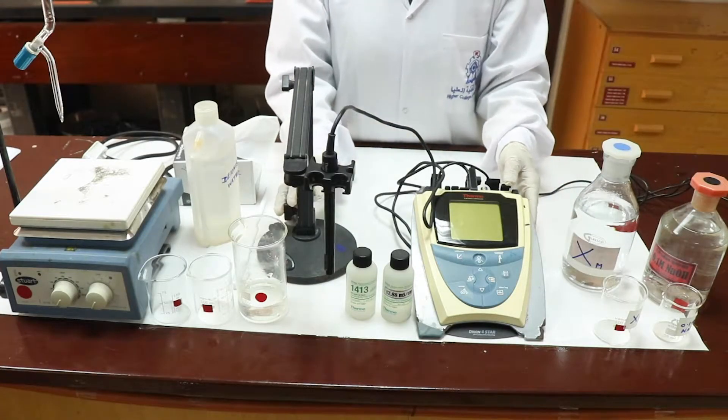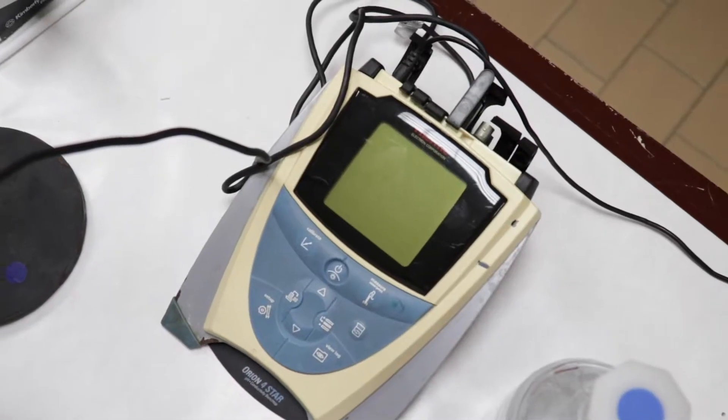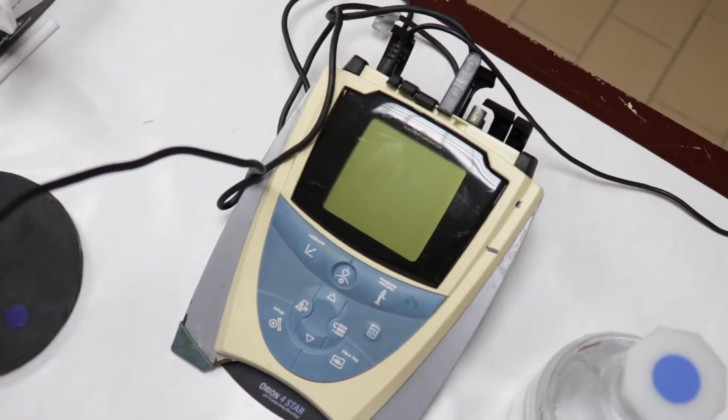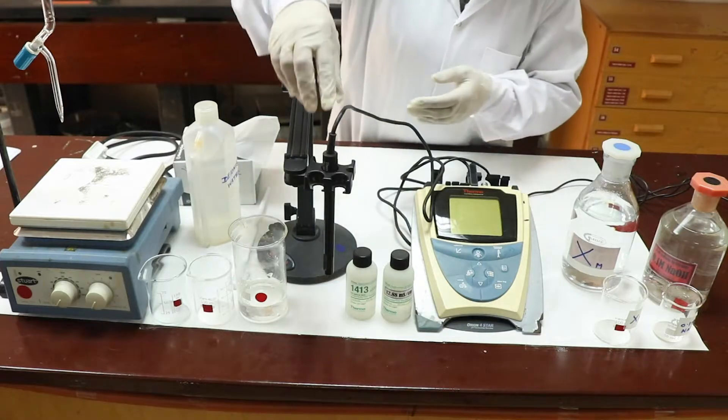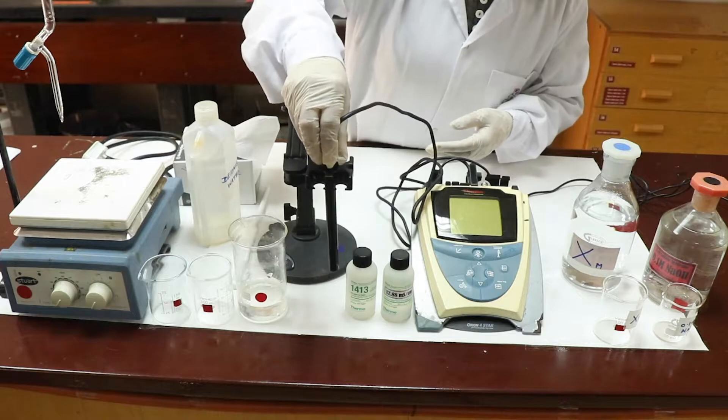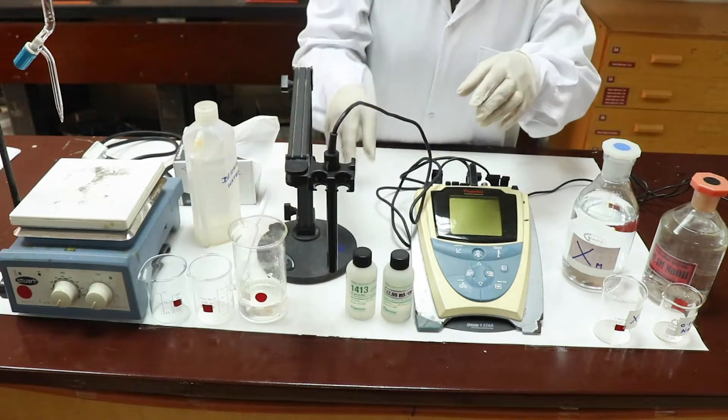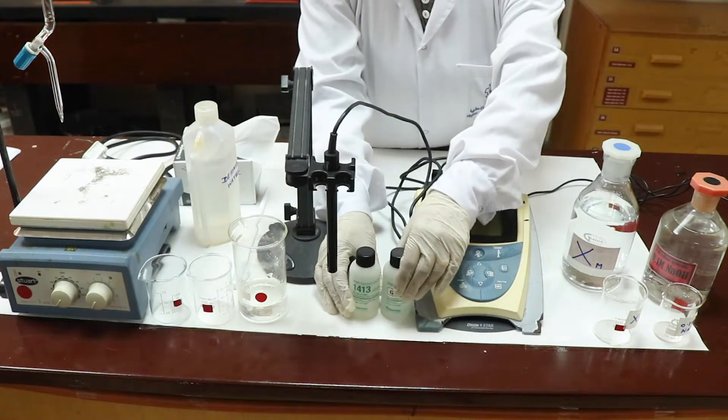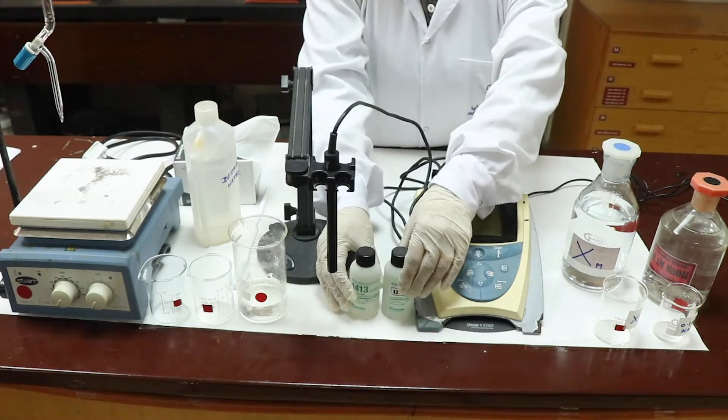You have the conductivity meter. This is multifunctional. It can be used as a pH meter as well. You have the glass electrode, the calibrating solutions whose conductivity is known for us.